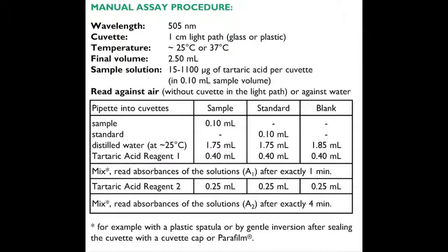In this video we will describe the manual assay procedure used for white wines. The settings for the assay procedure are a wavelength of 505 nanometers. The assay is performed in a one centimetre path length cuvette of three millilitres and a temperature of approximately 25 or 37 degrees.